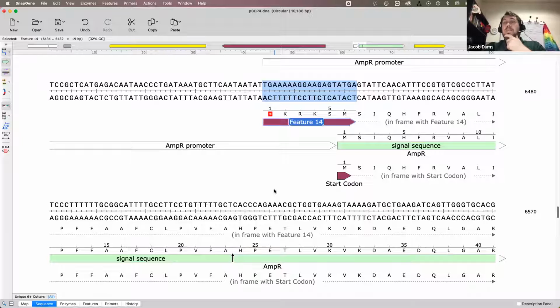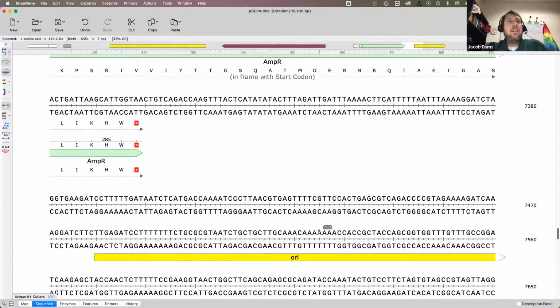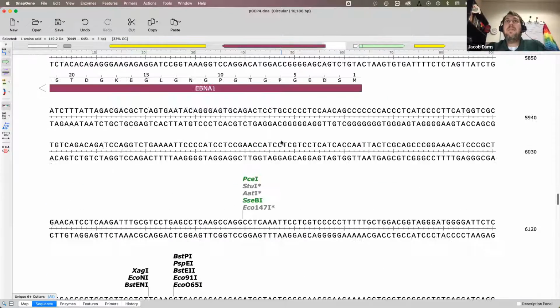It might not like it, but it will do that regardless. And so what this has done is it's pointing out that this is a stop codon, and then it will show me these other codons, and then again, it's just going to say, okay, this is the frame that I am in, and I accidentally selected the exact same frame to be in. So again, this will still stop at the same stop codon.